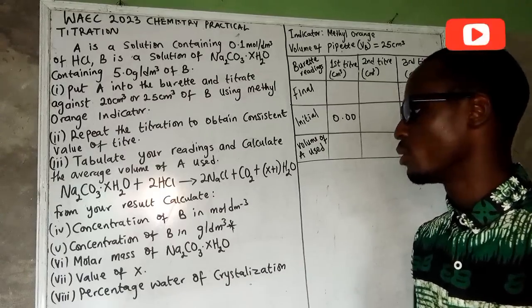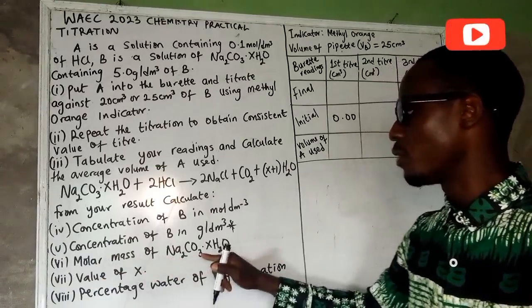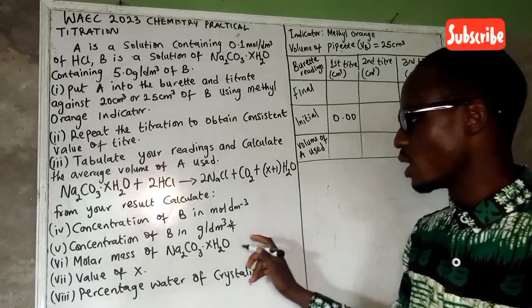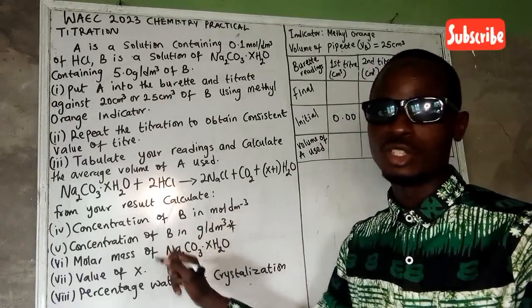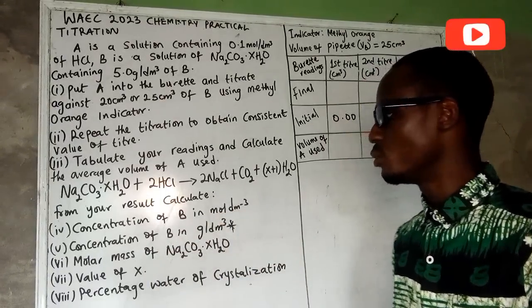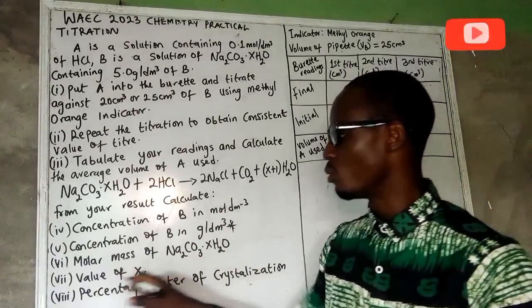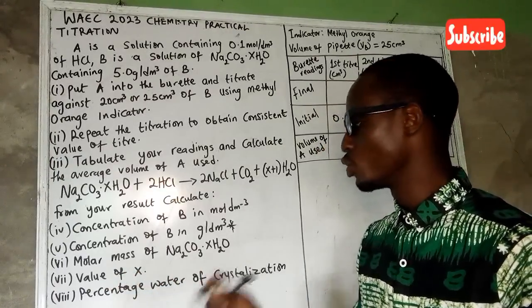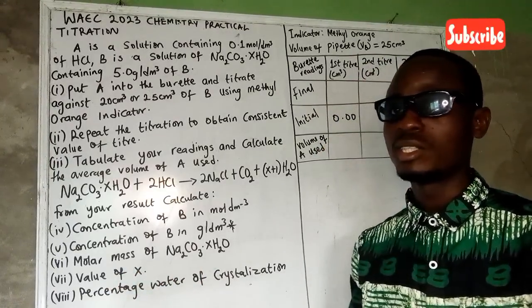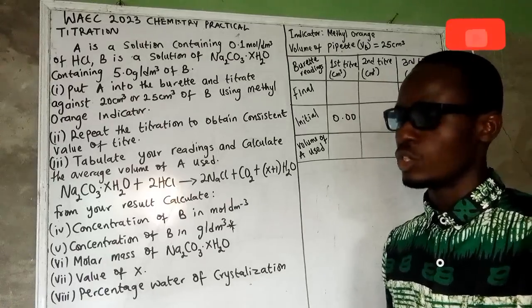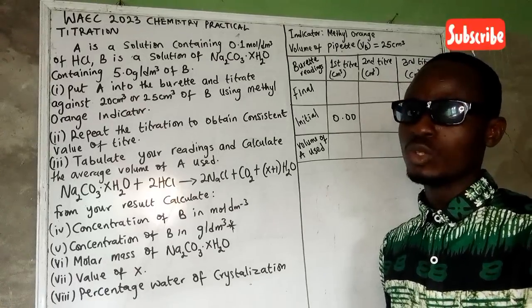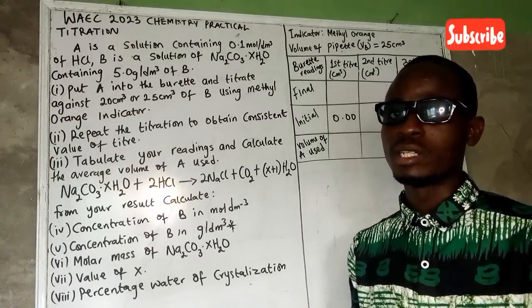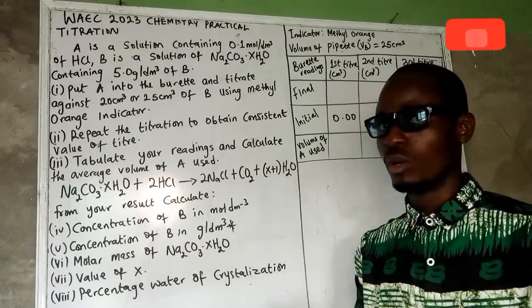We also determine the molar mass of Na₂CO₃·xH₂O. After determining the molar mass of the hydrated salt, it will be easier for us to know the value of x, and then determine the percentage water of crystallization in the salt. Now I'm going to bring the camera close to the practical and show how it is done.